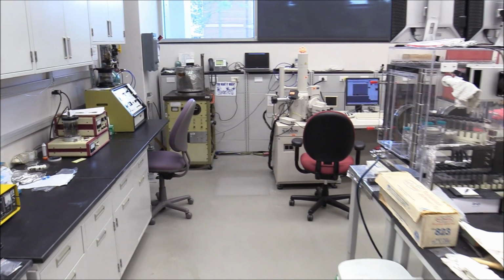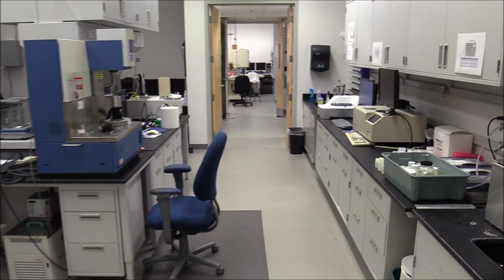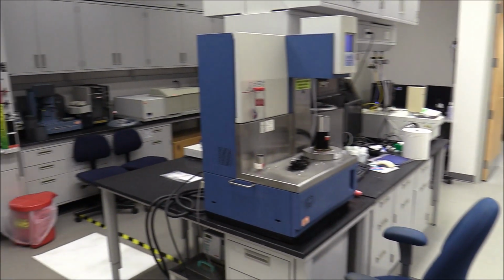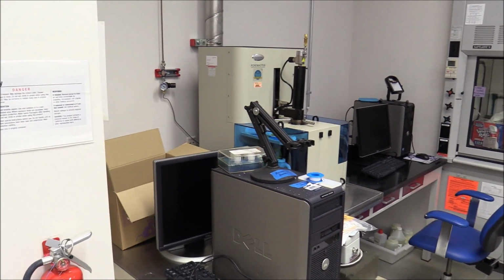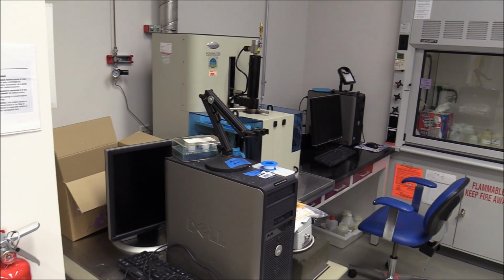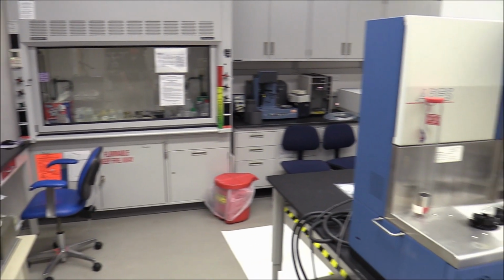As we move out of the lab, we go across the hallway to the third particle characterization and analysis lab. This lab has a viscometer, which measures the viscosity of a liquid at a fixed rate. On the left, you'll see the mercury porosometer. It's used to measure porosity of a material by applying controlled pressure to a sample immersed in mercury.